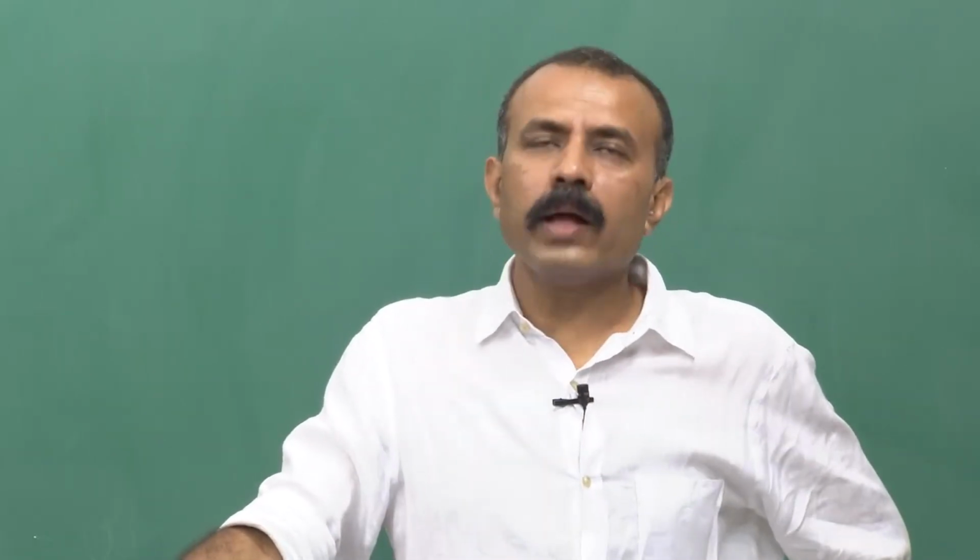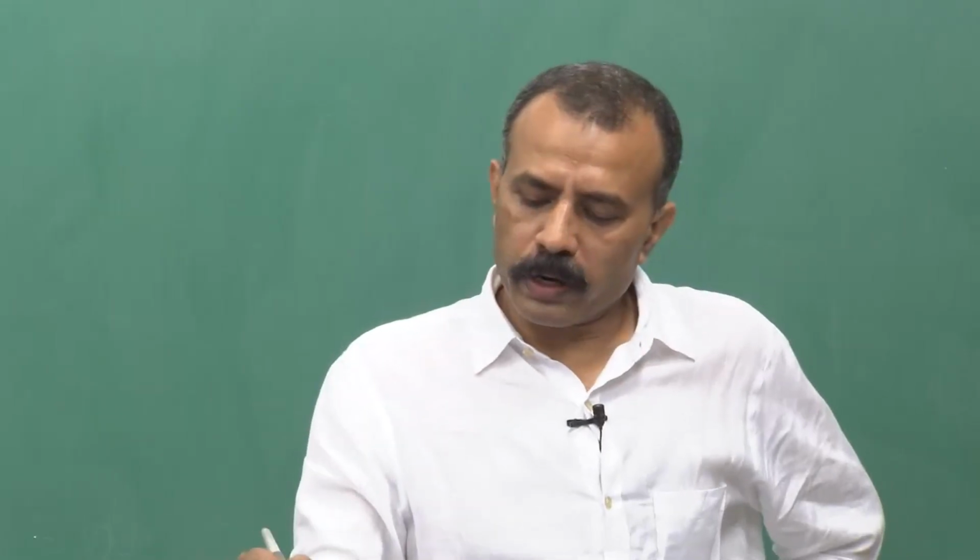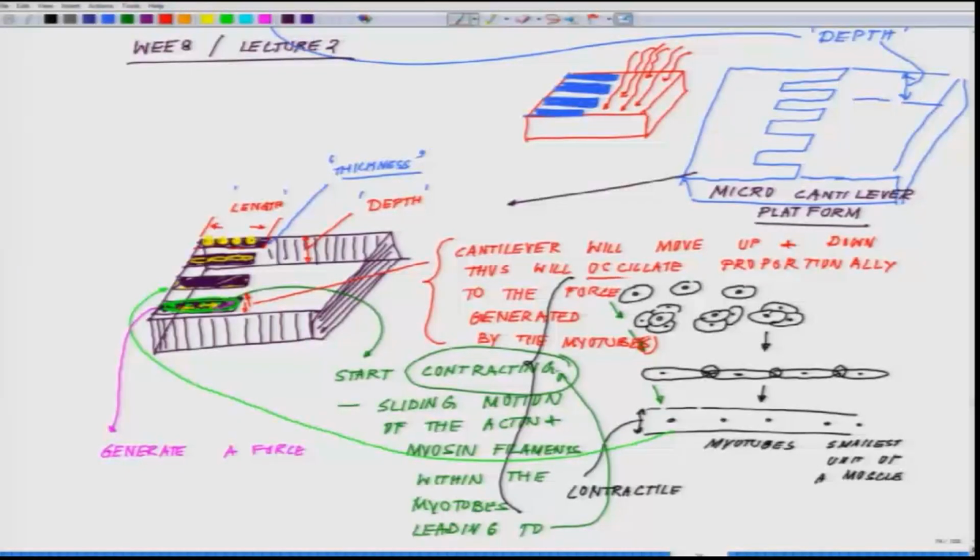Now, while this oscillation is taking place, you can correlate two things: this oscillation is directly proportional to the force generated. These two go hand in hand.